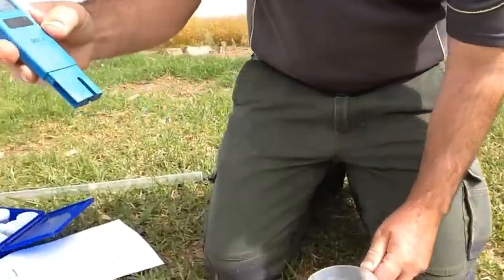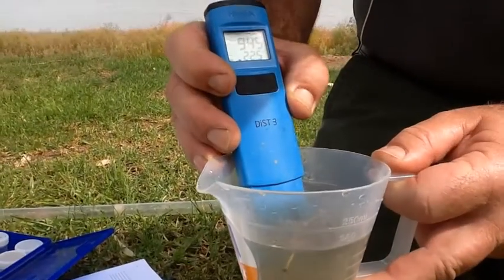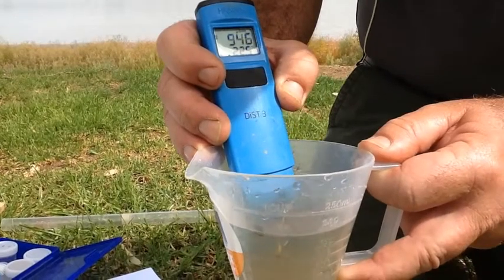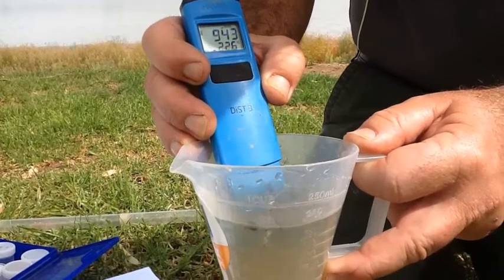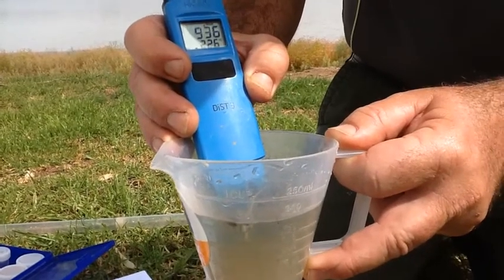All I do with this — I take the cap off, it's turned on, I immerse the probe into the water, and we start to let it read. Give it a little bit of time; you can see that it's equalised — 943 — just dropping a little bit, so we'll let it stabilise.